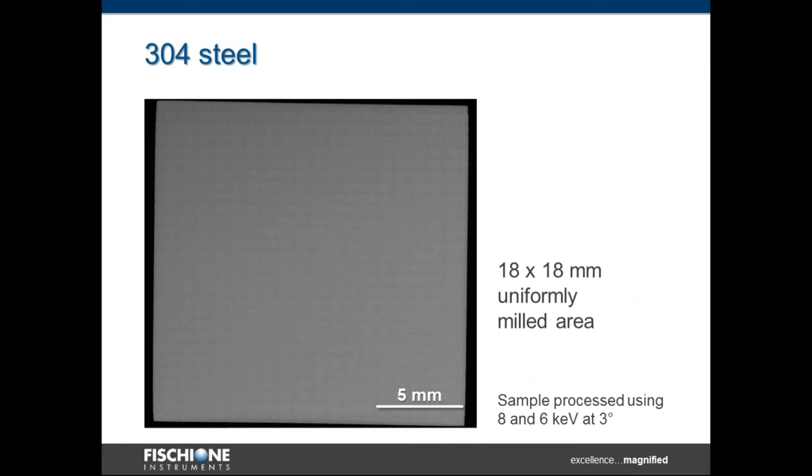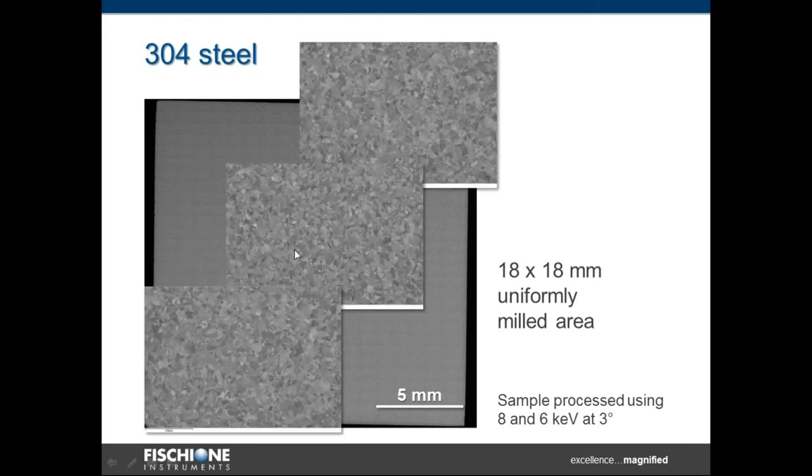The next example is austenitic steel. You can see here the sample that is 18 by 18 millimeters. We milled it by try-on mill and collected the images from whole area, then stitched them together. If you zoom at any place of that sample, a big sample, you will see that structure is very uniform. You can see very easily the austenitic steel structure, distinguish all the grains and see that milling was uniform across all the samples from the center to any corner or edge of that sample.